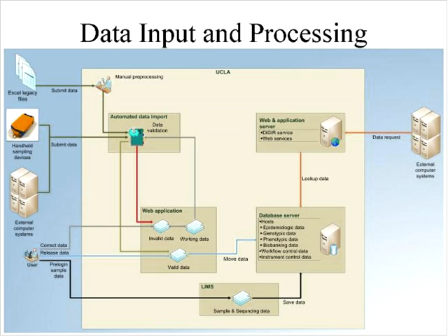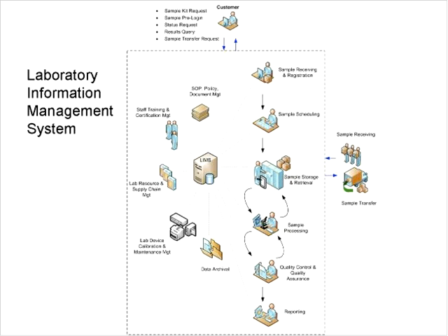And then in addition, also making sure that we have mechanisms for integrating the other types of information coming into the laboratory, a good example being data from, for instance, those handheld devices that I showed you, and also being able to export data for processing into a mode that can be accessed by researchers.